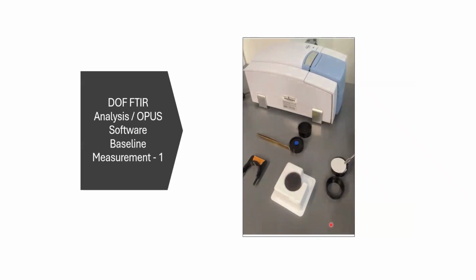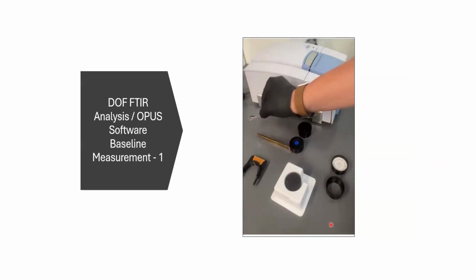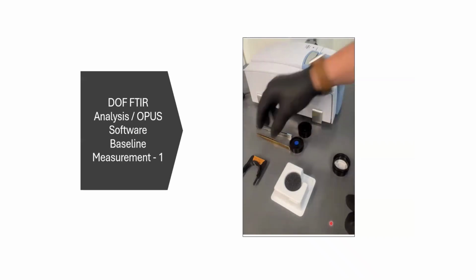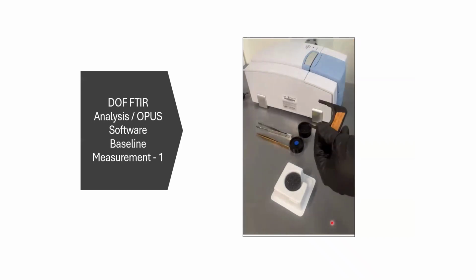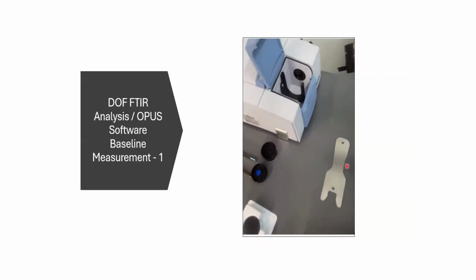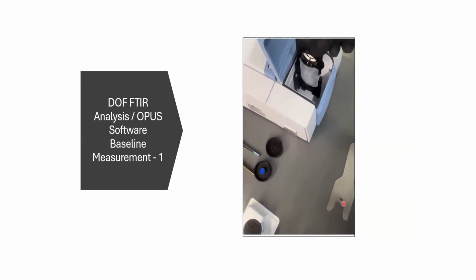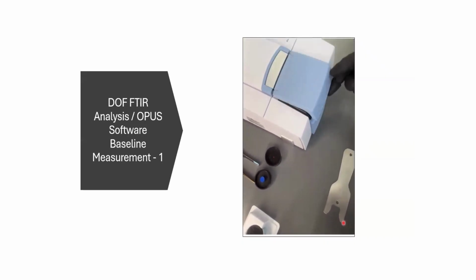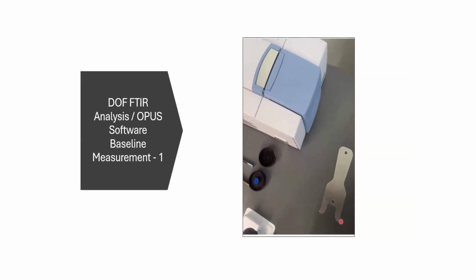After we take the pieces apart, we take a blank PVC filter and place it in the black cassette, and then insert the cassette into the cradle. And then load the blank filter into the FTIR instrument. Best practice is looking at the blank filter to make sure there are no contaminants visible on it, such as hair, dirt, etc.